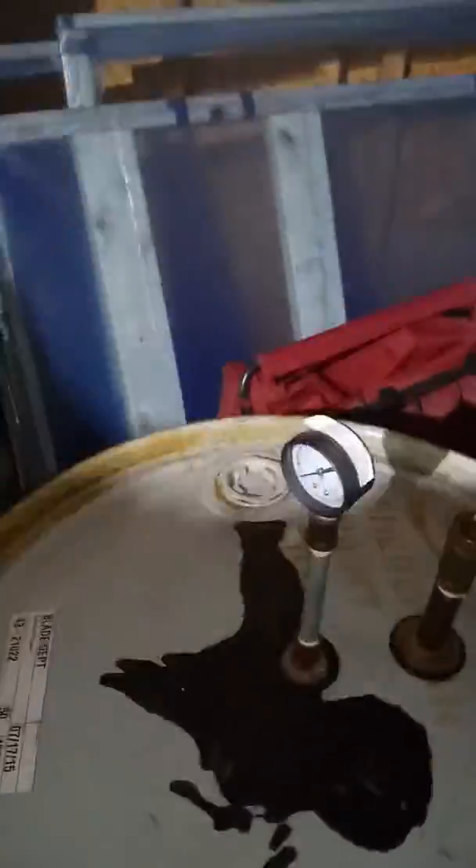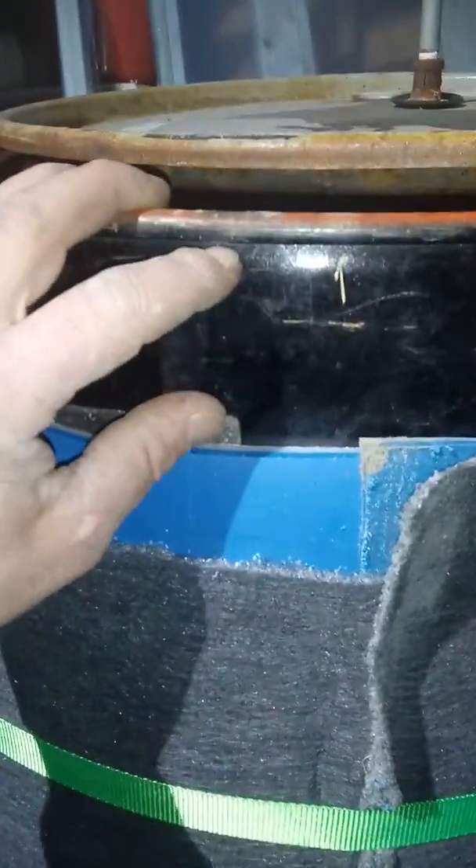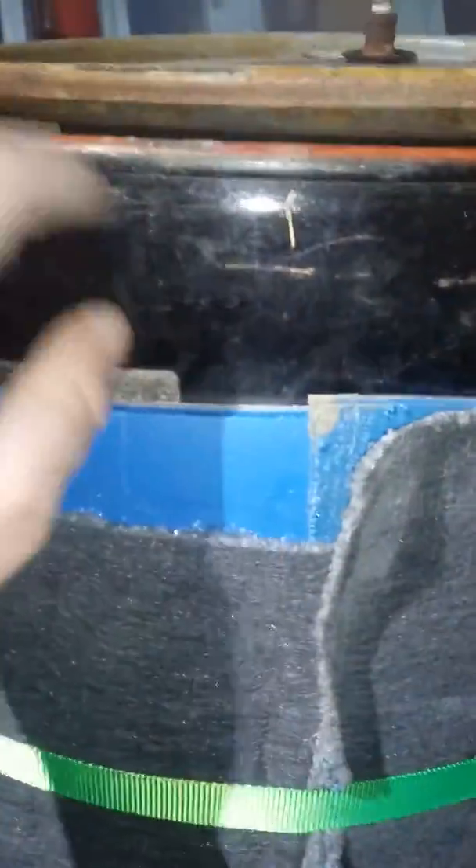Once I'm done I'm gonna use gorilla tape and tape it all the way around to keep it sealed. This insulation doesn't have to be perfect — a lot of the heat won't escape too much. You just want to keep most of the heat in, especially when you fill it full of water, so it retains heat throughout.